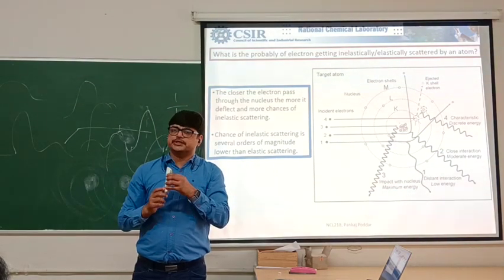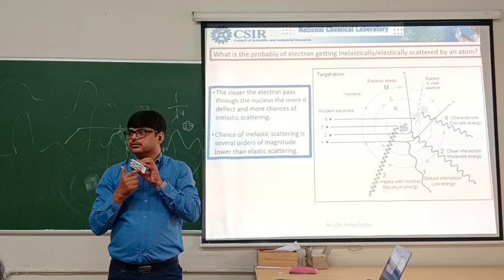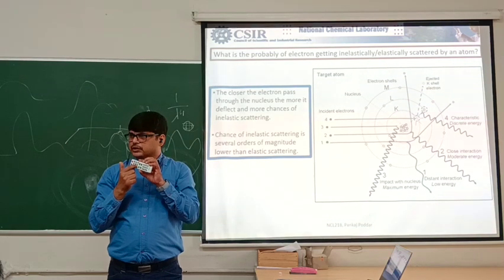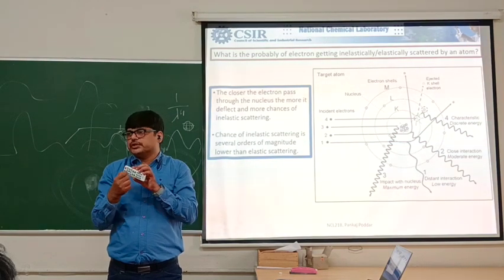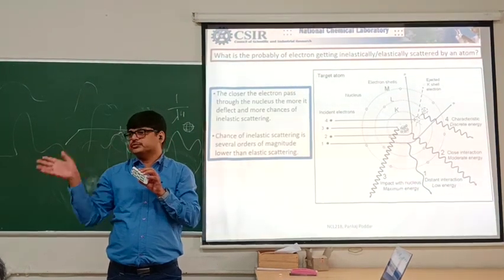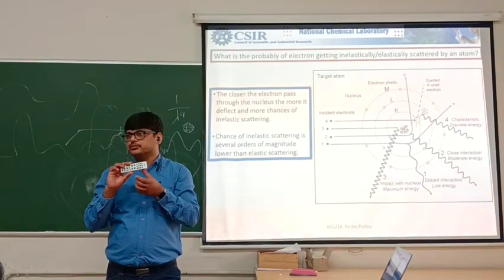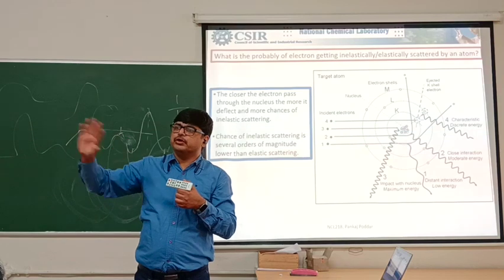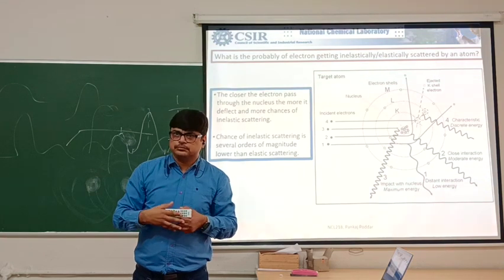And now Sheetal can say that no, I am interested in the chemistry of this also. What kind of atoms are there? Then you will get a lot of platinum or palladium peaks also, because you are coating with that. So if you know which metal you have coated from outside, you have to mask those atoms out. Suppose you are coating platinum or palladium on alumina, you know that the aluminum peak and oxygen peak are coming, and any gold peak or other metal peak you have to ignore. That is not part of your sample, that is just the coating material. Yes. Got it?